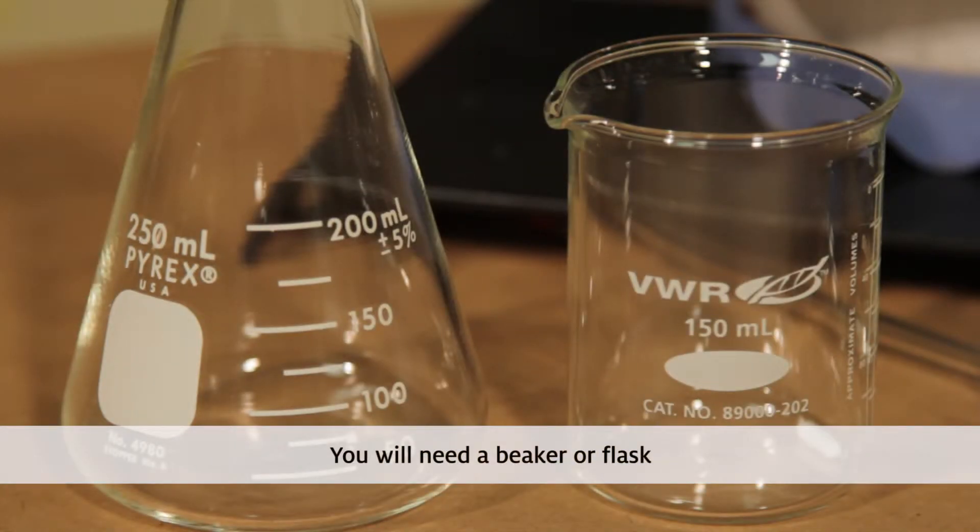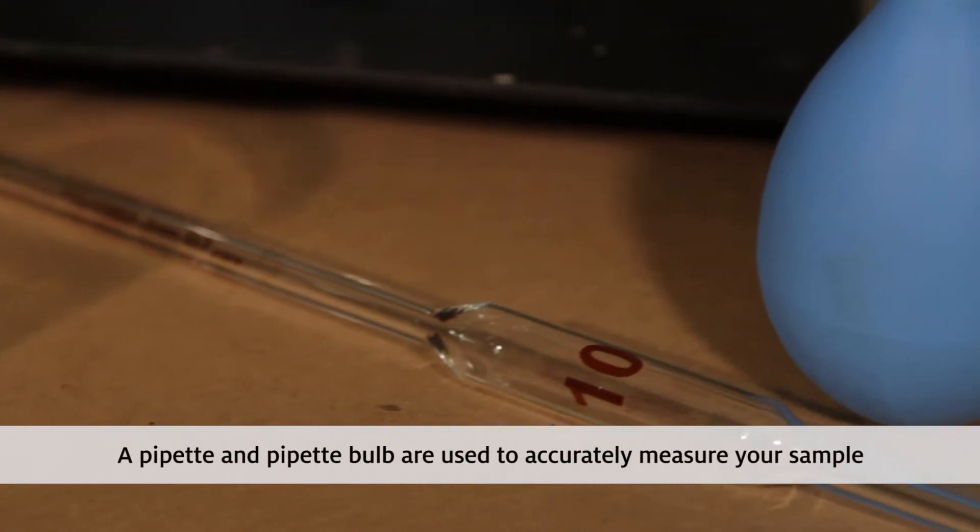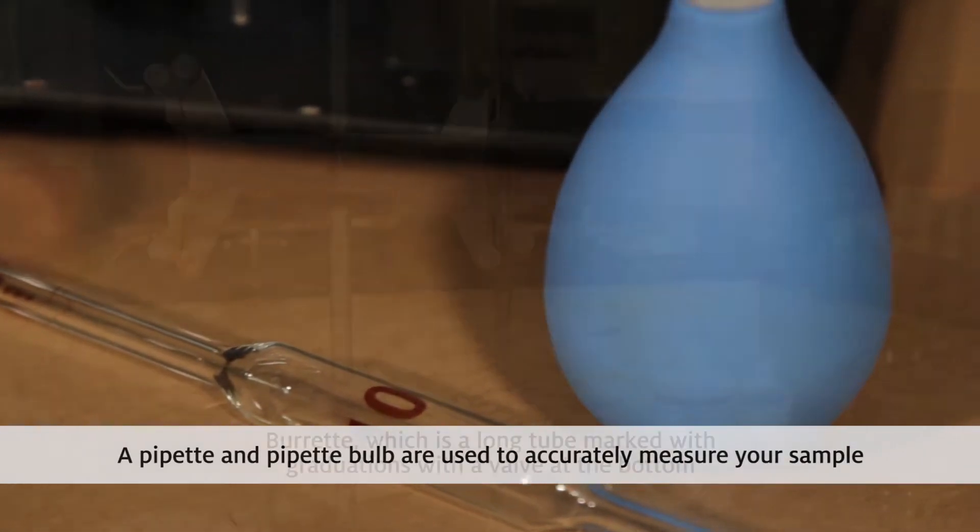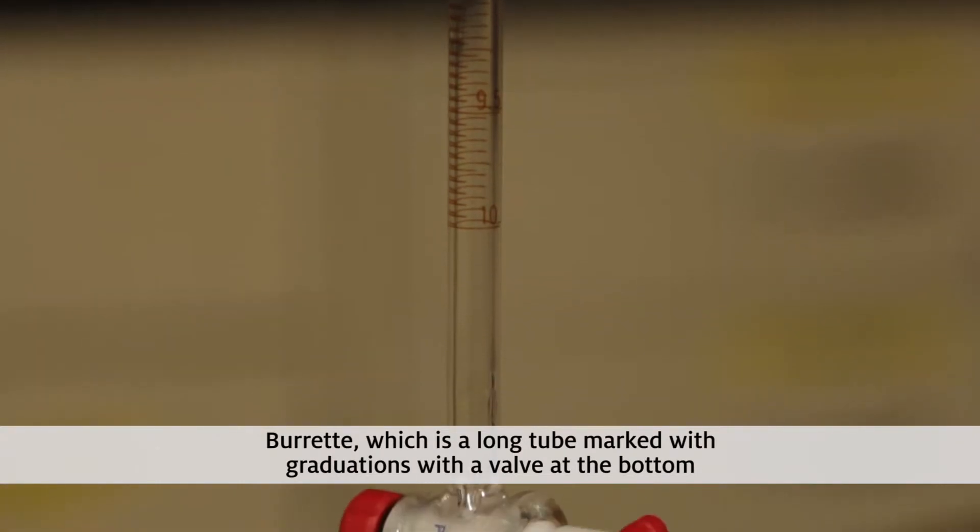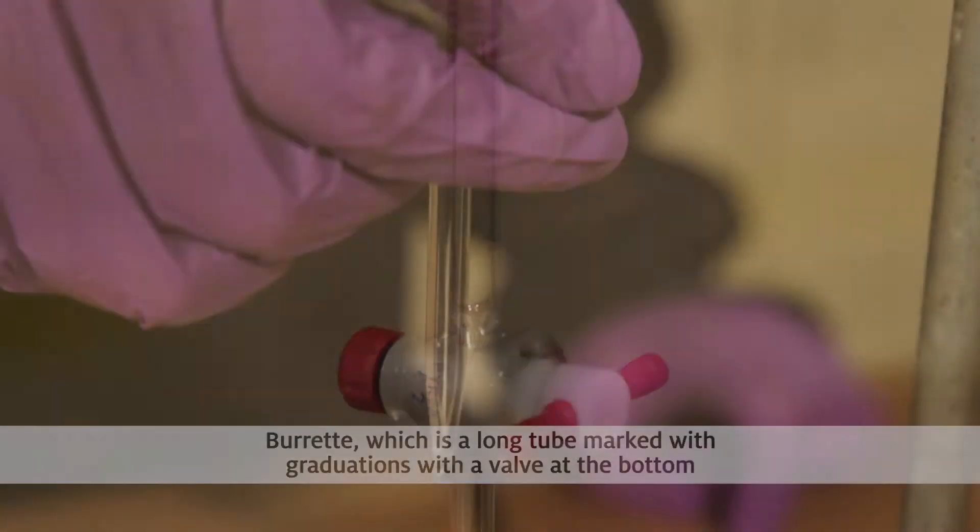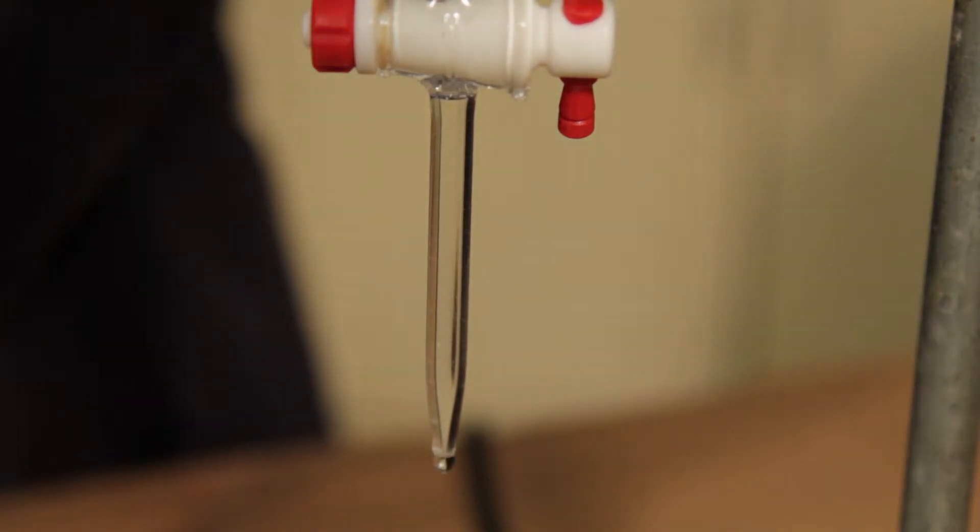You will need a beaker or flask in which to do the titration, a pipette and pipette bulb is used to accurately measure your sample, and finally you need a burette, which is a long tube marked with graduations with a valve at the bottom. It allows you to carefully add controlled amounts of titrant to your sample and easily measure it.